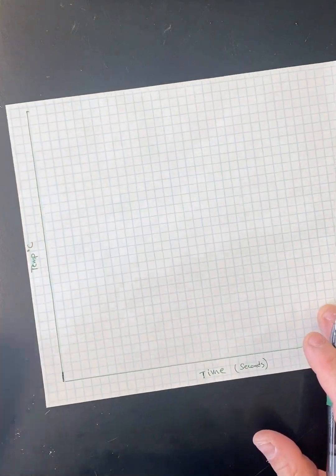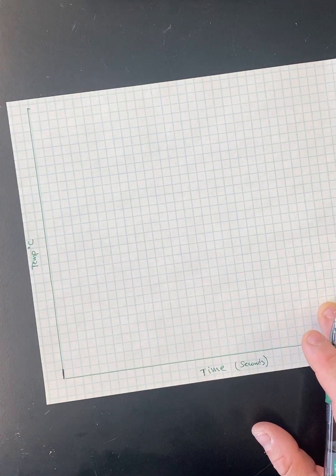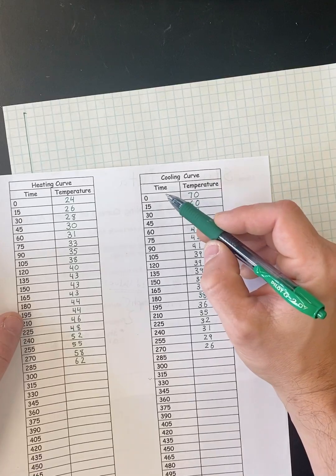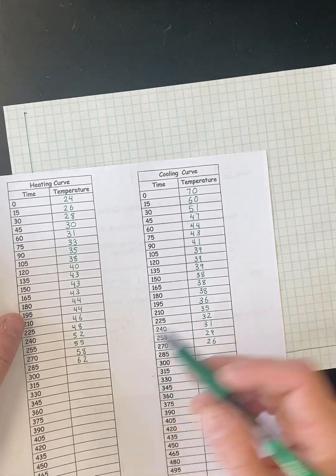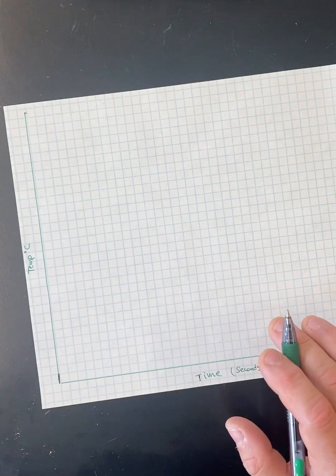So for your time, that's easy. The actual numbers, if you look, they're right here. So this is going to go 0, 15, 30, 45. They're going to keep going to 270 and 285 respectively. So you are going to be doing two graphs.